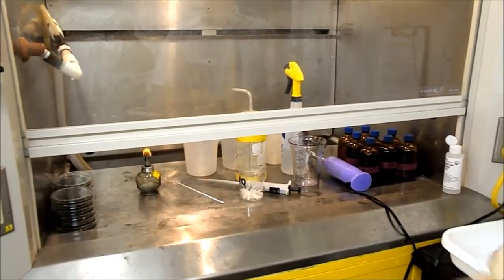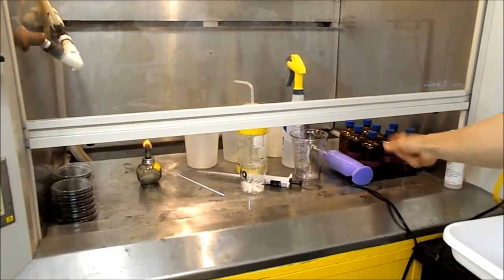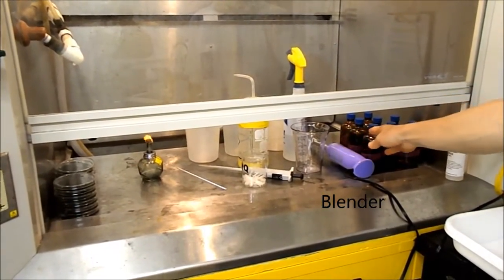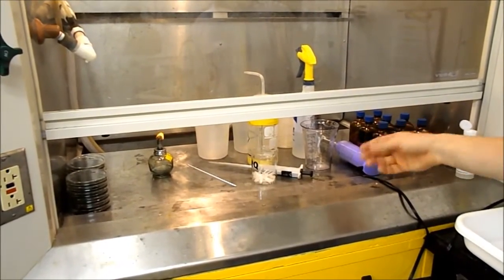And I'm going to try and work from right to left. Got my sample jars here, put 200 mils into here roughly. I'm going to blend it with the blender, which has been sterilised. That's to release the Vibrio cells from all the solids in the sample.